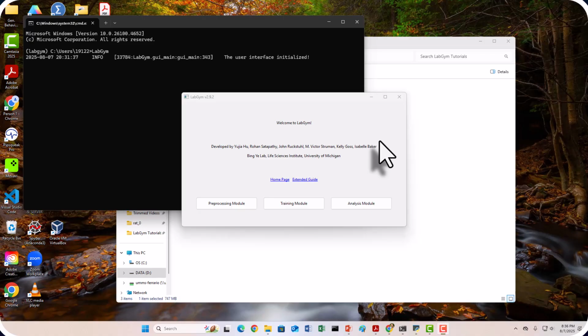These are all optional modifications, but they do allow you to batch process multiple videos at once, and reducing frame rate and frame size will reduce the size of the files that you work with, which can usually get very large, and therefore reduce the amount of processing power needed to work with the files. Most of your videos are going to be between 15 to 30 frames per second, which is typically a good range to be in. It's typically good enough, but your frames per second must be the same for all videos that will be used to train the detector and analyzer.